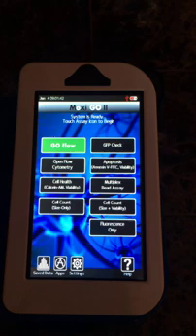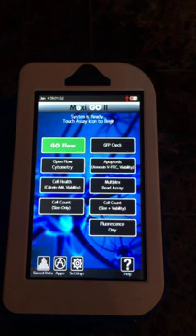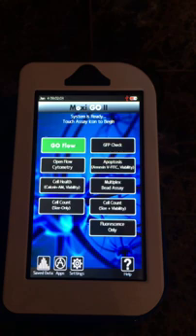The key benefits of the MOXIGO are that it delivers gold standard count accuracy and simultaneous cell volume with two channels of fluorescent flow output. It also eliminates many of the hassle points with traditional flow cytometry — there is no cleaning or maintenance or any issues with clogging that can lead to significant downtime.